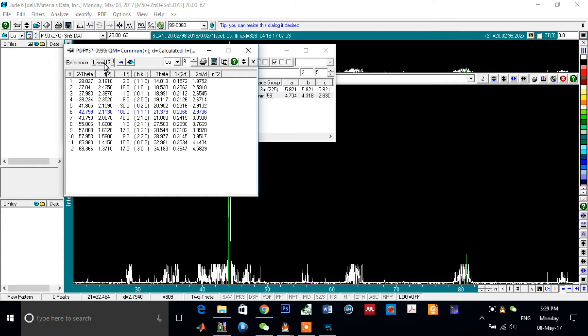If you want to know the HKL, this column, if you want to know the HKL of the peaks according to 2 Theta.